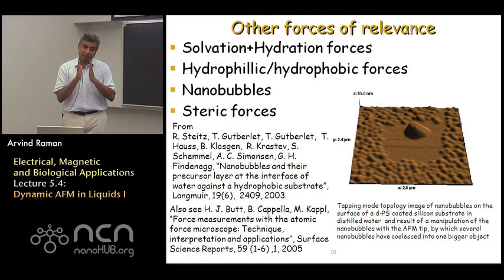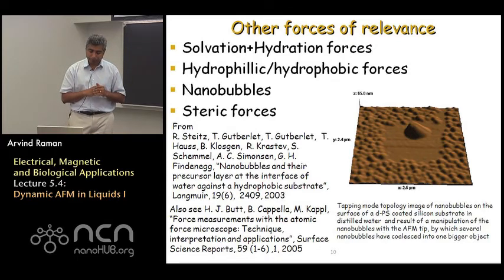So the hydration force refers to the force that's needed to remove the water that's naturally associated or layered on surfaces in solvation shells. So as you bring a tip close to the sample, you have to imagine that there's a few layers of molecules that are adhering or hydrated to the tip and the sample. As you bring a tip close to the sample, those have to be pushed apart. So that's a short-range repulsive interaction, often modeled by an exponential term. In the case of molecularly flat surfaces, people have observed that the hydration forces are actually oscillatory. But that's an important force that comes in for really short-range interactions.